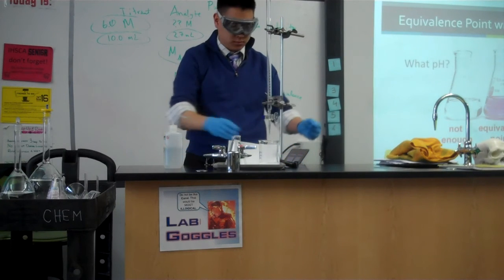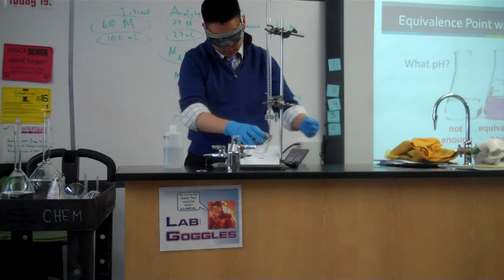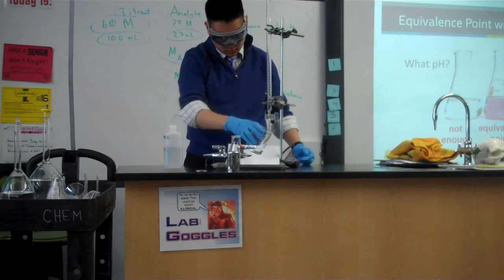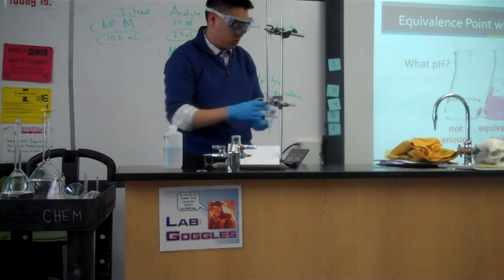Now, this is pure water, maybe some impurity. So what we're going to do is just get rid of it. Alright, now let's close it up. Pour this down the drain.